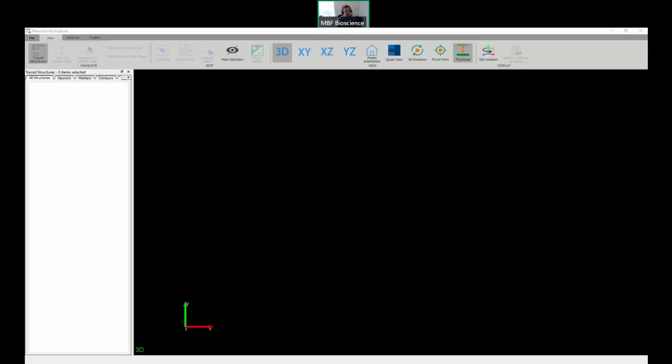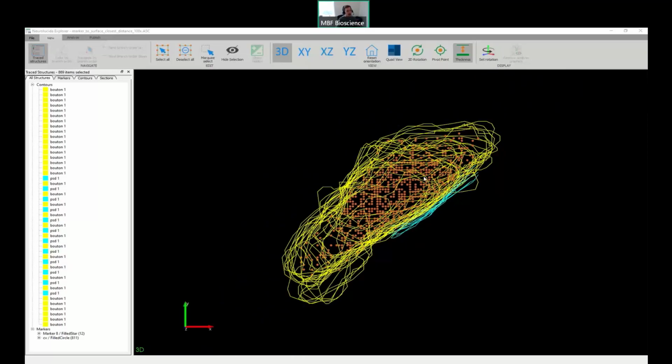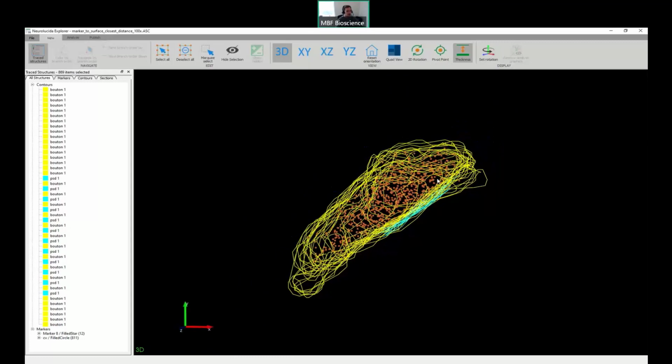One of the big things that we'll typically see is as people start to generate massive data sets, there tends to be a lot of markers that get generated. Markers are a really great tool to mark something of importance, or to just get a good understanding of location of things, or if you need to mark cells. But regardless, once you have markers placed down, you can see that as the data file shows up at its default, they can be a little bit difficult to visualize right away.